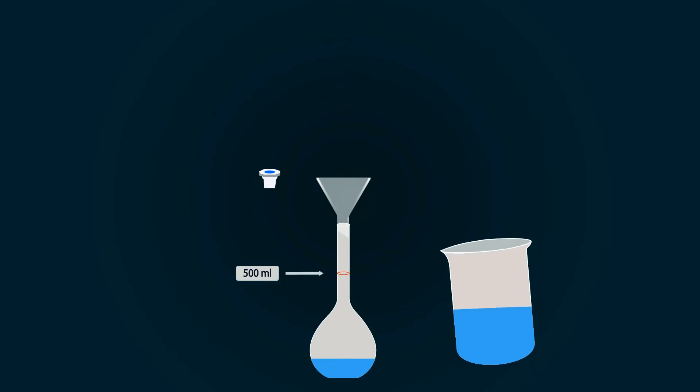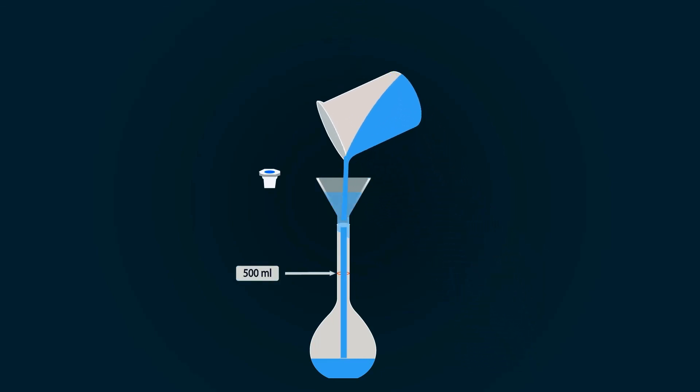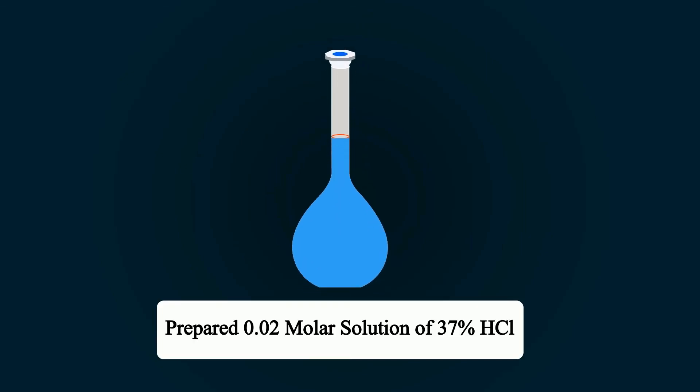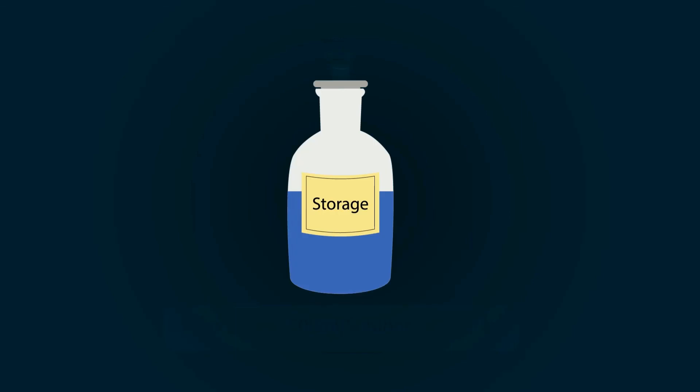Fill the volumetric flask with distilled water up to the 500 milliliter mark. You have successfully prepared a 0.02 molar solution of 37% HCl. You can store it in any bottle you want. Thank you.